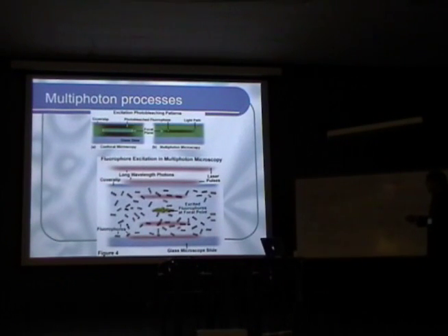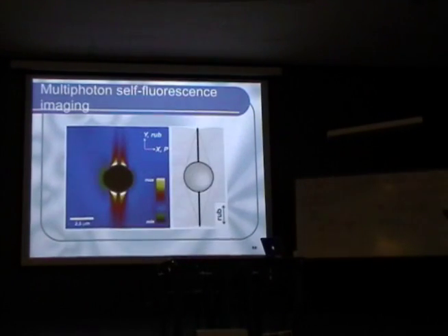And so, because of the intrinsic nonlinear optical nature of the multi-photon excitation process, as we have seen, we can excite the chromophores only in the vicinity of the focal plane of the objective and detect the fluorescence light coming from the region of interest, in this case, in the close vicinity of the focal point of the sample.